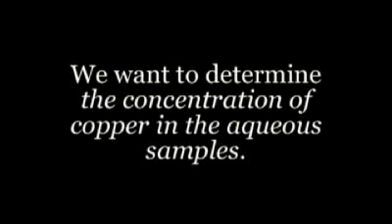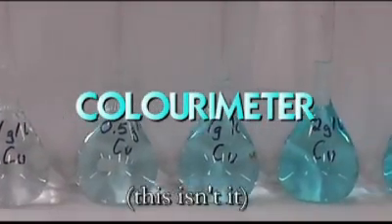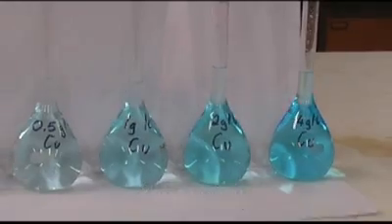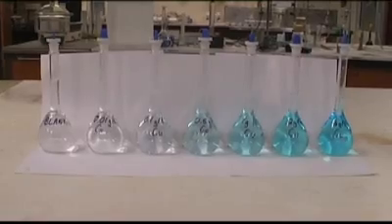So what's the go with comparing the samples? Well, we're checking to determine the concentration of copper in each of the aqueous layer samples. Surely there's a machine that can do that. Yes, there is — it's called a colourimeter. It works by using a wavelength of about 625 nanometers to measure the absorbance of the solutions. By drawing a Beer-Lambert curve, it's possible to gauge the concentration of each of the samples.